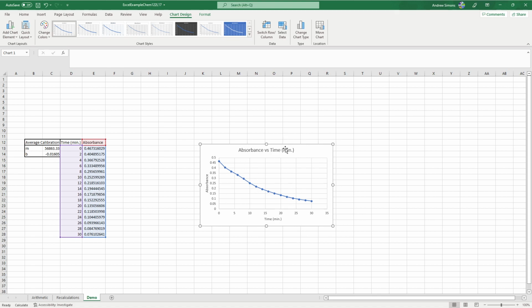Because I believe on this experiment, we're going to need 3 or 4 graphs. You need to show me a graph of your calibration curve, which you should have all been able to successfully export from Logger Pro. I believe we talked about that. If you haven't, you can just email me, and then I can help you figure that out.